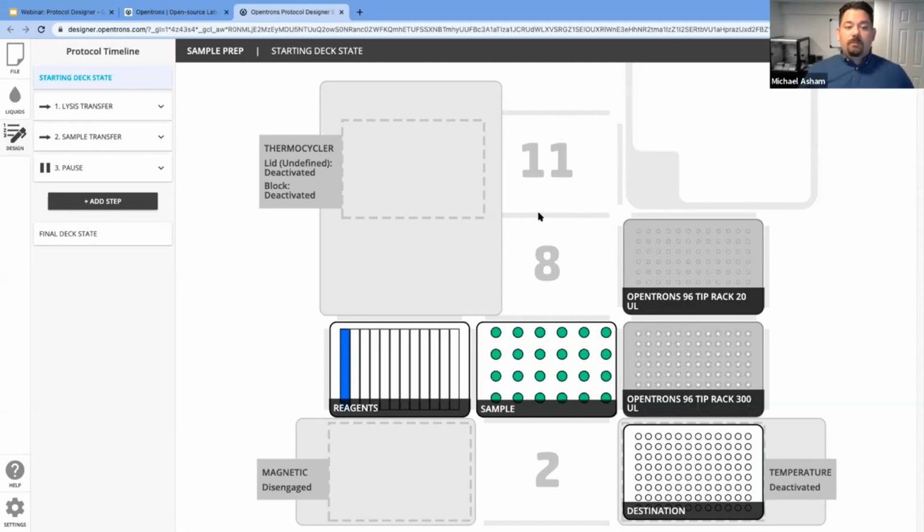Next question is, does your company PM or do preventative maintenance on the instruments periodically to ensure pipetting accuracy? And do you have preventative maintenance protocols in place? Yeah, that's a really great question. So Opentrons operates on a customer enablement model where we encourage our customers to take the care and maintenance of the instruments into their own hands. And so we have a full preventative maintenance guide that we can provide that was built by our support team. And it serves as an excellent source of documentation for how to care for the instrument and how to check things like accuracy and precision.